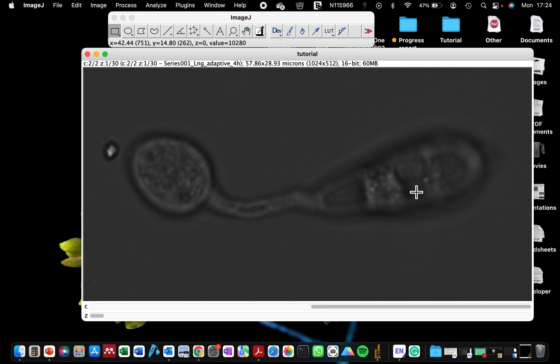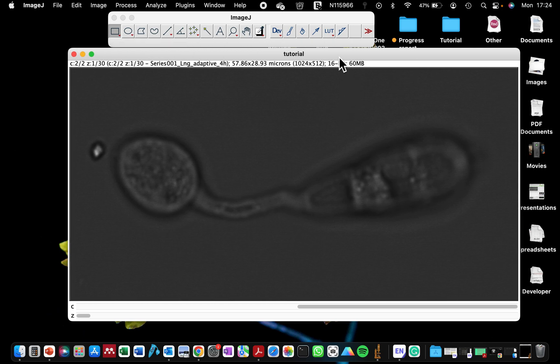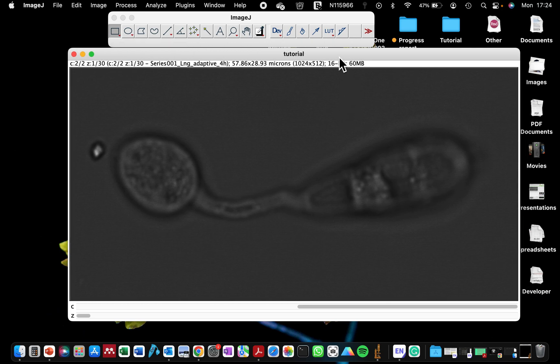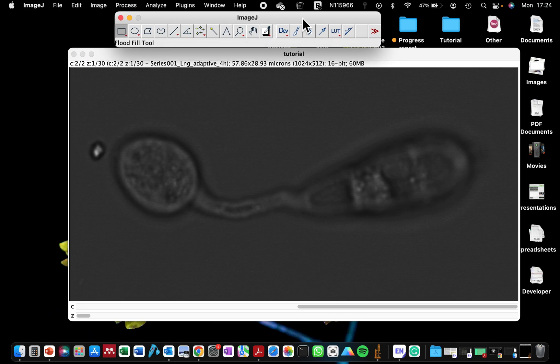I'm on holiday and the room next door is playing some program on the TV. In my video today, I'm going to be showing you how to increase the brightness of your microscope image.